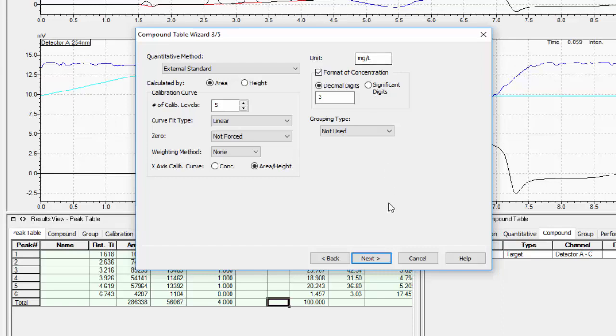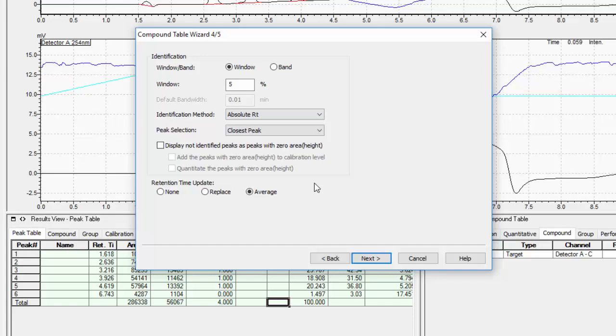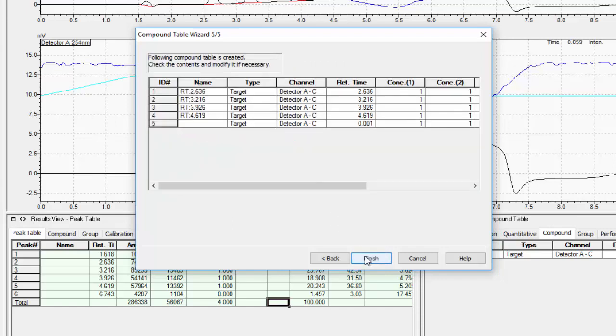Once you click next again, you will have an opportunity to adjust the identification criteria for the peaks. This is basically the wiggle room you are granting the software when identifying your selected peaks at that time. If your chromatography is slightly shifting from run to run, you may need to widen these values in order for the software to identify your peaks of interest. Generally speaking, our advice is for you to leave these values at their default level. Any shifting in peaks represents a challenge or problem in your chromatography method, and you should not compensate for that with software unless absolutely necessary.